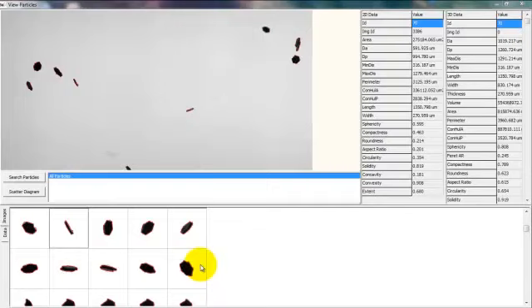The DIA then has the unique ability, patented, of calculating all three major dimensions of each particle for the only 3D image analysis available. Here we report not only the length and the width, but also the thickness, the third dimension of the particle. Again, unique to the industry.